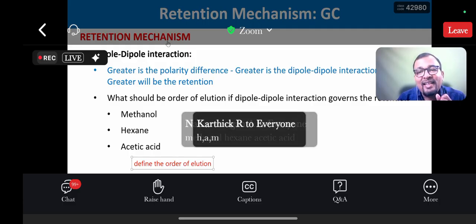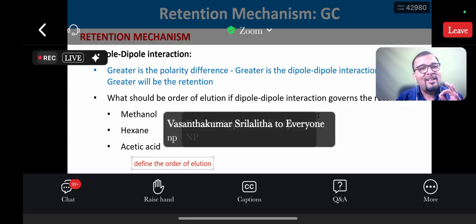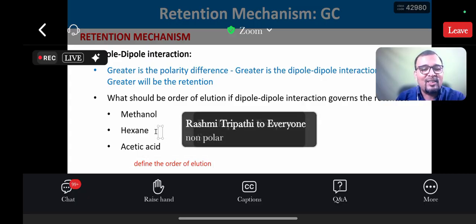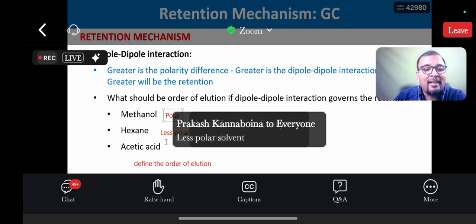Why does hexane come first? What is the reason hexane comes first? Because it is non-polar. Yes or no? It is less polar, right? So hexane is less polar, methanol is polar, and what about acetic acid? It's highly polar.